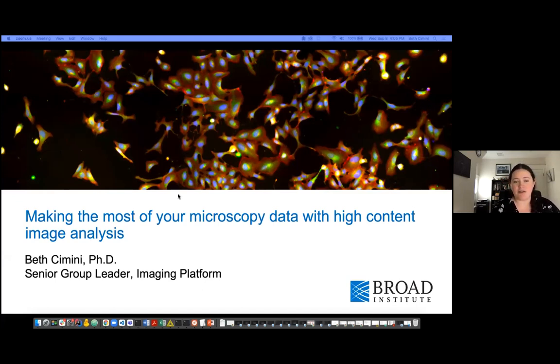I'm first going to talk about high content analysis and doing high content analysis with CellProfiler. What are some considerations in putting together a high content analysis experiment? And in the second half of the talk, I'm going to talk about some of the things that you can do with high content analysis that are hard to do unless you are using an automated software to generate lots and lots of measured features from every image that you have. And so hopefully that will motivate why tools like CellProfiler are really valuable.